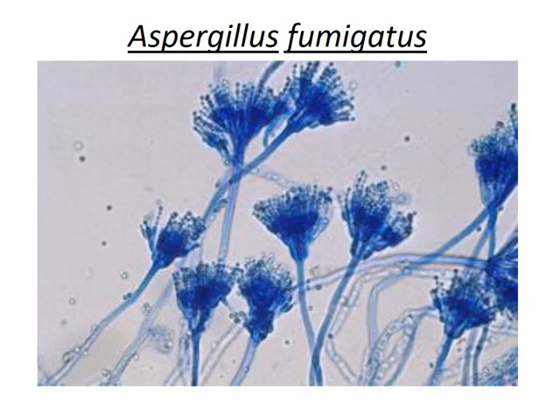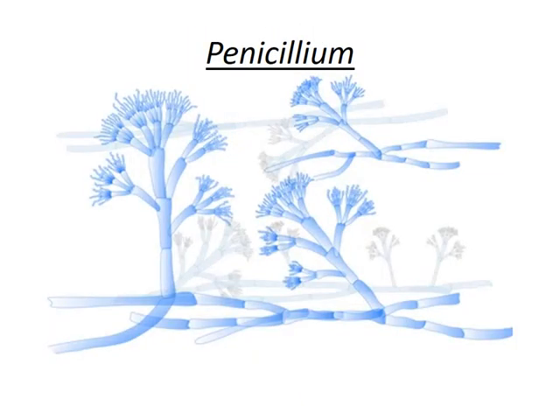As can be observed, the fungal structure is stained dark blue in color due to the cotton blue stain. What we can observe in the diagram are the long structures — that is, the fungal mycelium or hyphae — which give rise to conidiophores, and it is these conidiophores that bear the conidia.